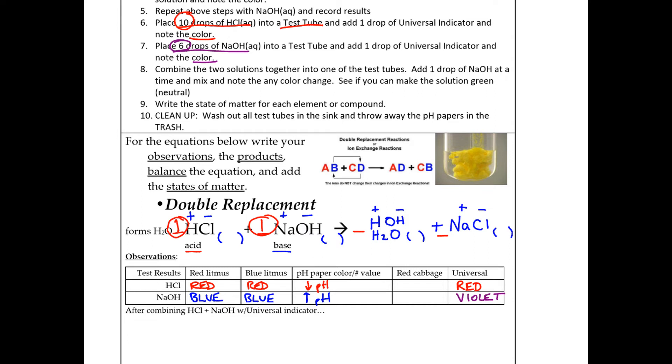So what we're doing is, we're slowly adding NaOH into this combo. So if you add six NaOH drops to 10 HCl drops, you're going to still have extra HCl here, because they're not equal amounts. And so because it's extra HCl, the color is going to stay red, because it's still an acid. Then you add a seventh drop, it's going to stay red. An eighth drop, it's going to stay red. Ninth drop. Tenth drop, they're going to be even.